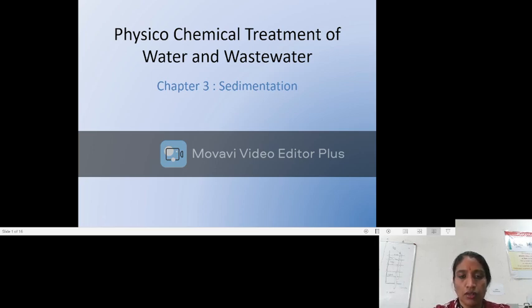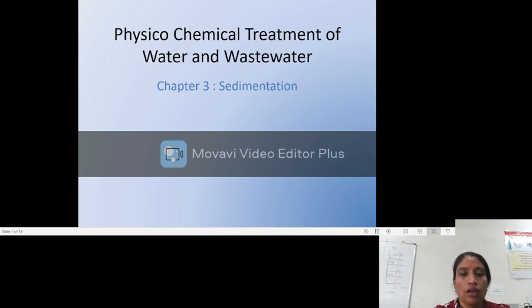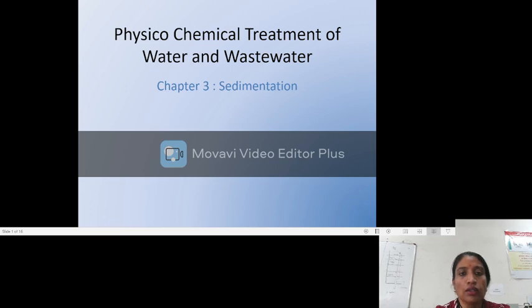Now I'm going to present a video, give a presentation on e-content prepared as a part of the task given in the training, learning-centric approaches. I have prepared a video based on physicochemical treatment of water and wastewater, which is a 5th semester course, chapter 3, sedimentation. And I'm going to explain how to find the optimum dose of a coagulant using jar test.